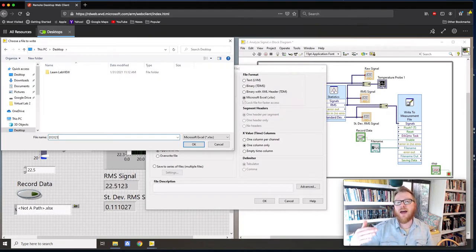And the reason why I have to do that is because if I get all the way to October 10, my data files are no longer going to be in chronological order. So I think this is a good habit to get into, is to name your files the name of the day. And I would write that in my lab notebook, right? In my lab notebook, I would say file name 013121, and today is January 31st, 2021.